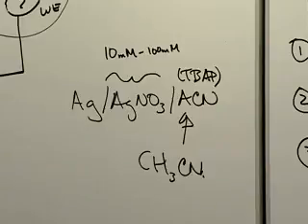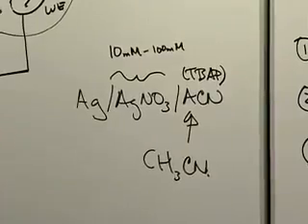That is, another source of potential drop that I really haven't mentioned, I should add another term on, is junction potential. So if I have one solvent in my electrochemical cell and a second solvent in my reference electrode, and I put them together and there's a frit in between them, I develop a potential just because there's a free energy difference, obviously, between two different solutions made of totally different things. And I should add that junction potential or free energy in here as another drop in potential.